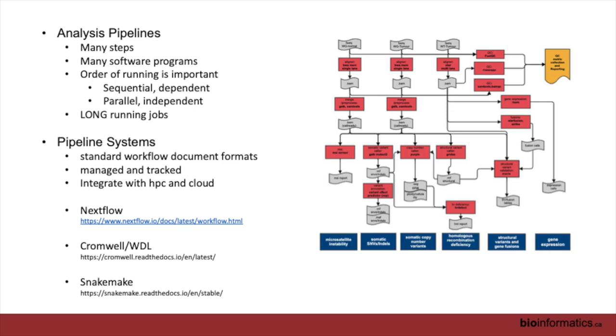I just mentioned on that as well, that our pipelines are actually built in a system called Cromwell and WDL. There's a number of different systems that are set up. It's a standardization of how you write a pipeline. I think earlier on people would write their own ways of automating things. Now a lot of it's standardized. Nextflow in particular is doing quite well, especially in cloud-based work. A lot of people are writing stuff in Nextflow. We work in a system that was developed at the Broad Institute using a workflow engine called Cromwell and building workflows in WDL. And another engine that people use is called Snakemake. All doing the same thing in different ways, but all with the same purpose, to allow you to run something as big as this, just set it off and let it run.